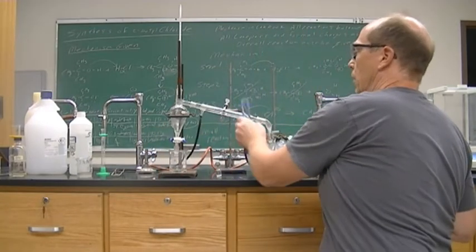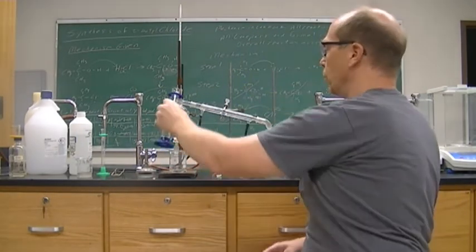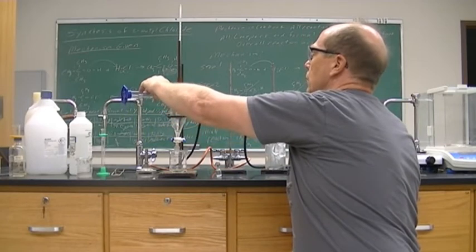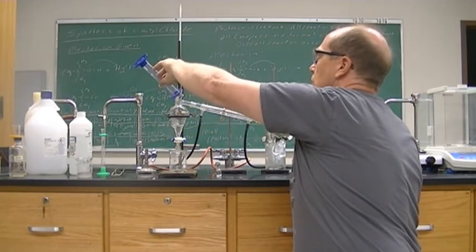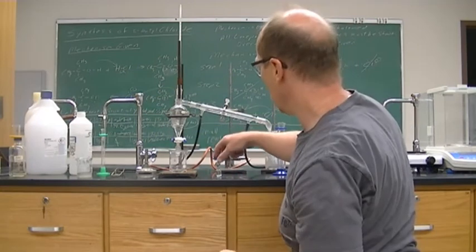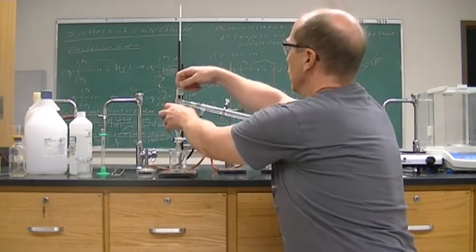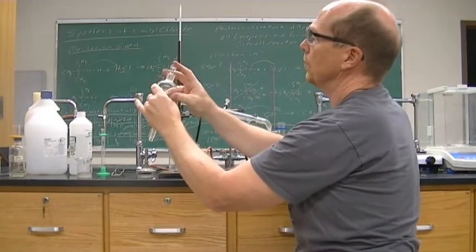And then we add our sodium bicarbonate. If there is acid, this will release carbon dioxide, so you may see some foaming. If there is acid in here, the sodium bicarbonate is going to react with it, releasing CO2 gas. If there was any, it was very, very minimal. I did not see any formation of carbon dioxide. All right, so again, we'll mix this up.